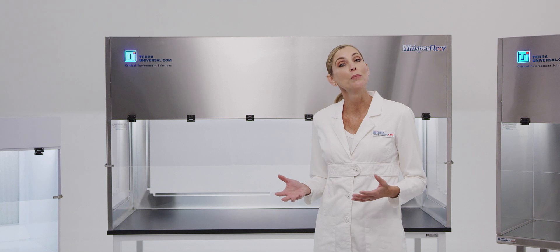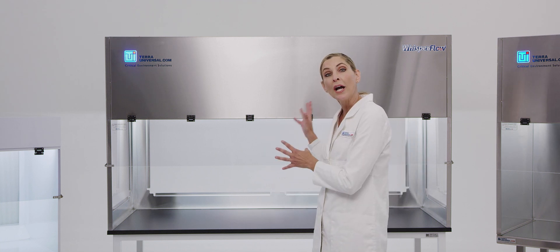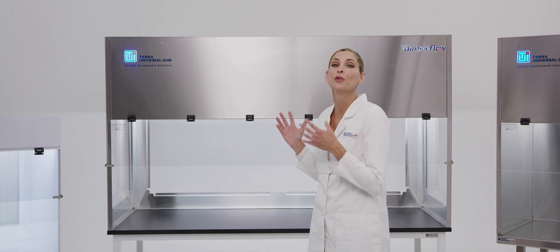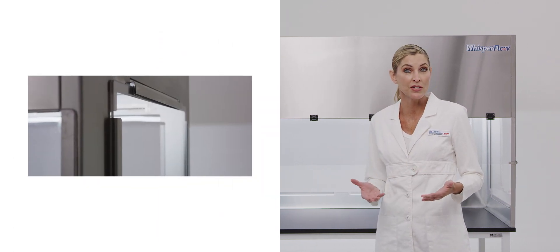Terra's WhisperFlow Benchtop Laminar Flow Hoods are offered in several sizes. This six-foot wide hood includes space for two operators working concurrently. Terra's WhisperFlow hoods feature removable side panels for added versatility.